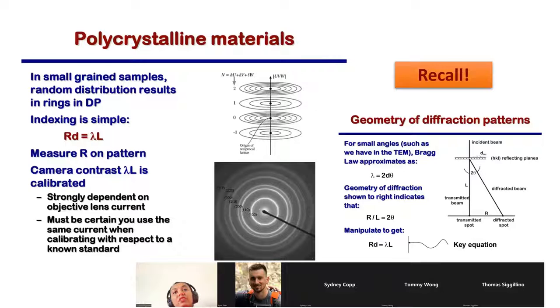We have 100, then it becomes 110, then 200, and then 210. So there could be an exercise in your TEM, where you should be able to convert the pattern of a polycrystal to a single crystal. And in large part, you can do that.